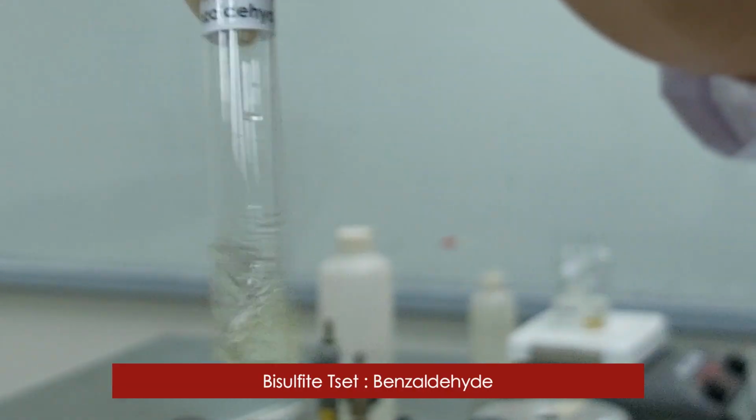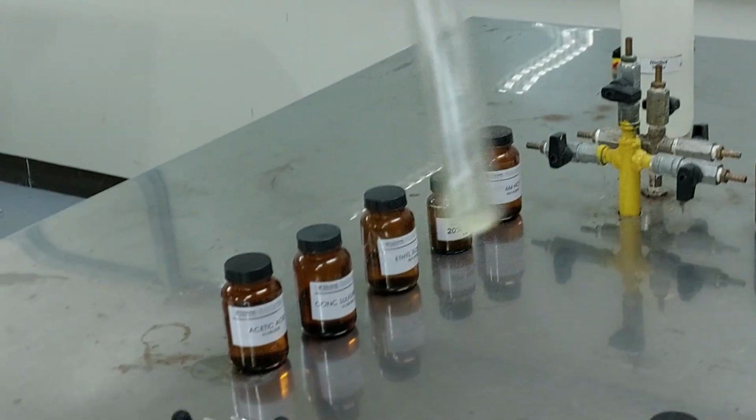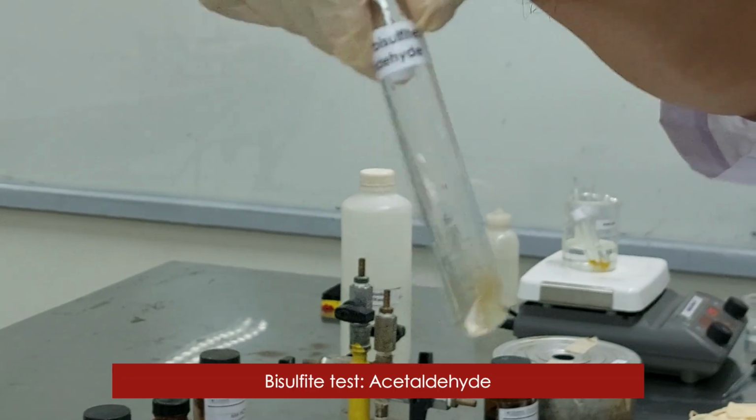So that is for benzaldehyde. That white precipitate is the salt. Look for the reaction of sodium bisulfite with aldehydes and ketones. So this is our acetaldehyde.